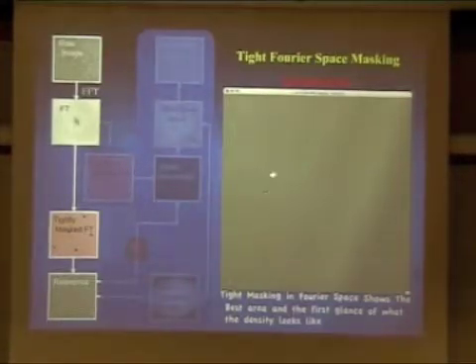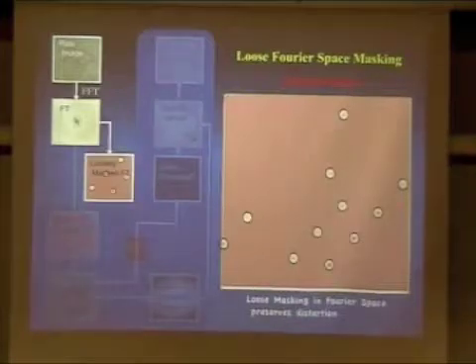You can see where the good patches are, where you have good contrast and a regular arrangement right around there, but the area that's basically just not crystal. So by looking at this, you will be able to create your reference.